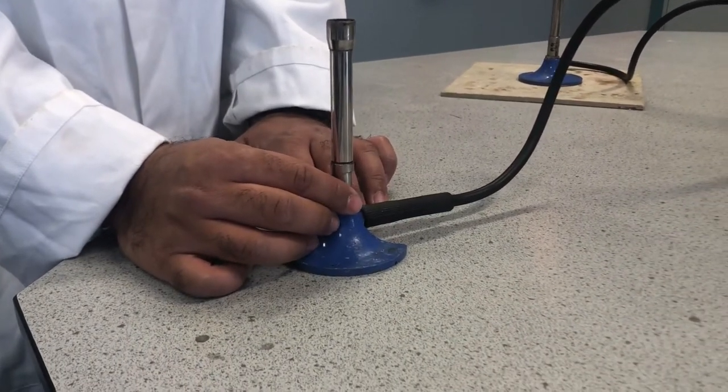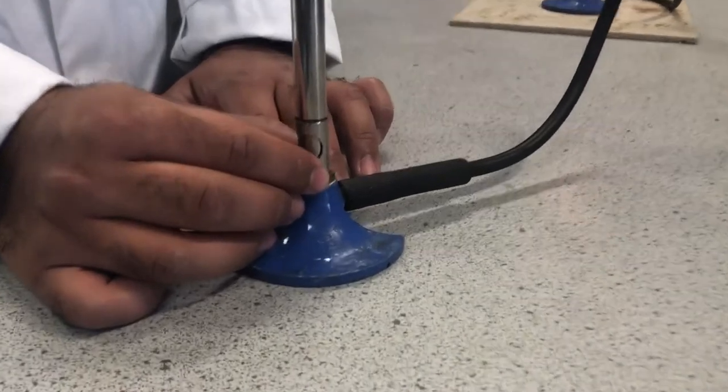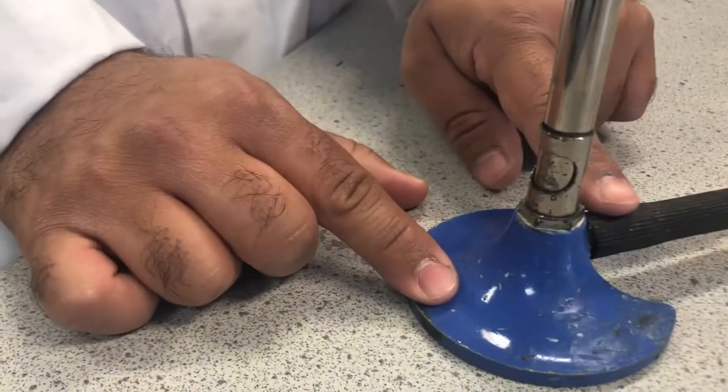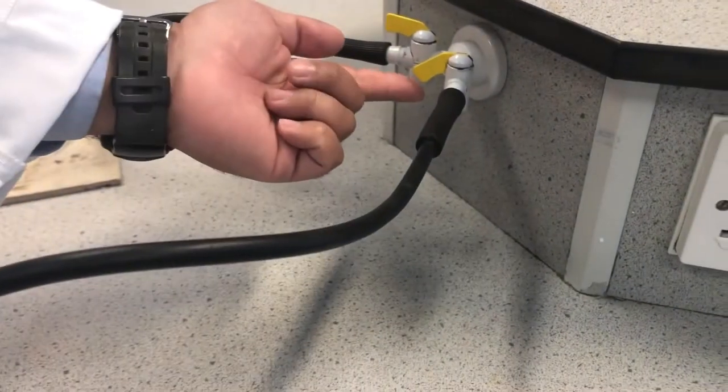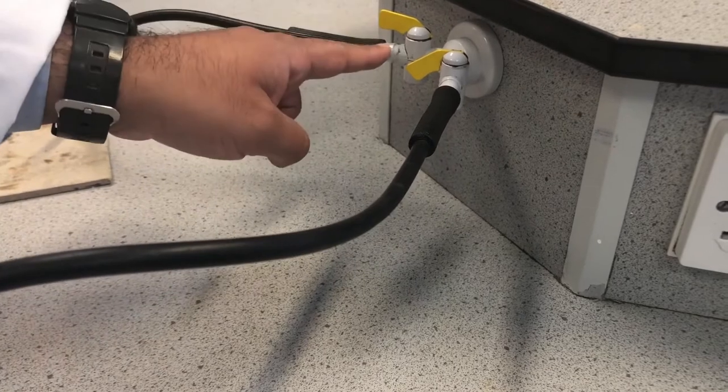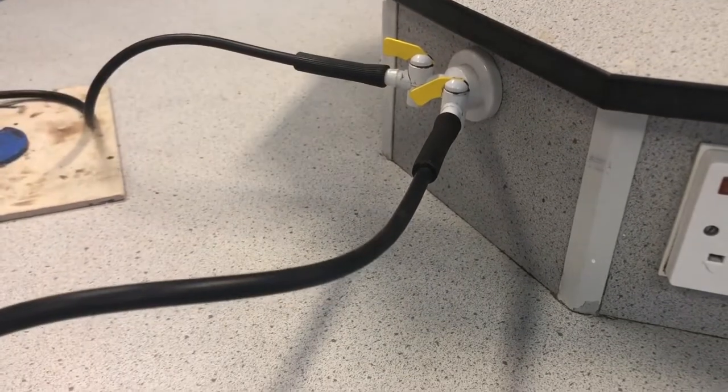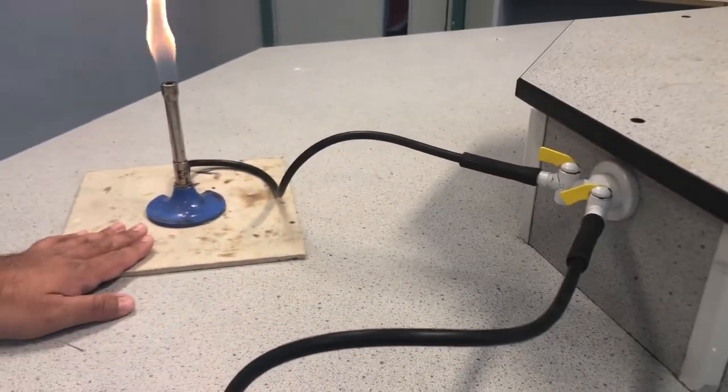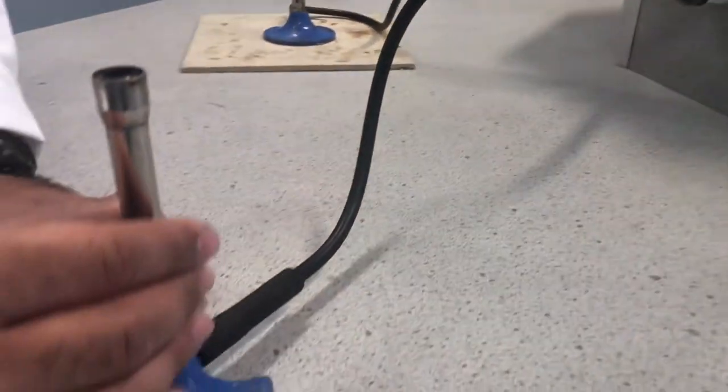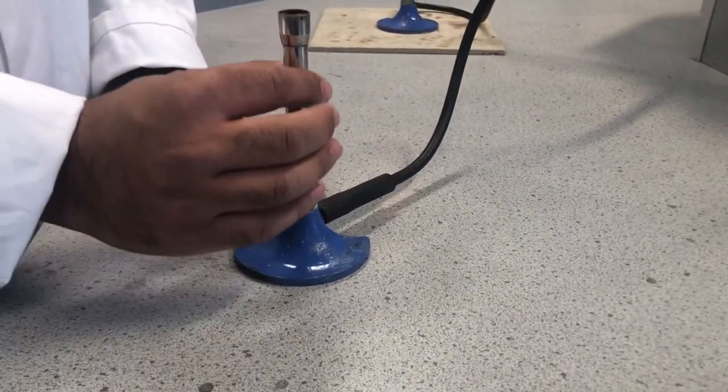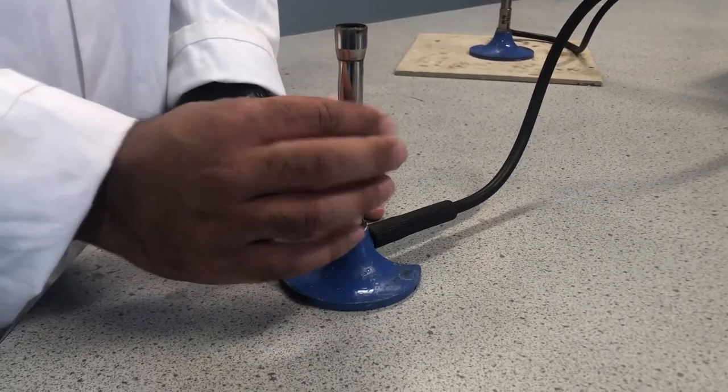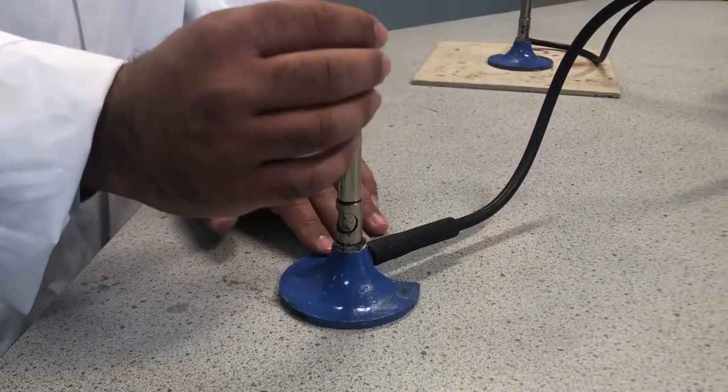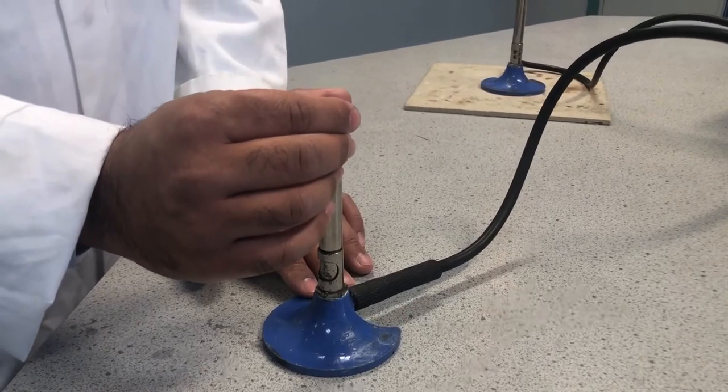You have the collar here where you can adjust the amount of oxygen that comes in. Your gas supply is obviously coming from this rubber tubing, which leads to our gas taps over here. This is the off position and this position is on. As you can see, this Bunsen burner is lit. We'll be coming back to that one in just a second. But back to the one over here, this is our collar or our chimney, sometimes referred to as the barrel. And this is the mouth of the Bunsen burner just there.